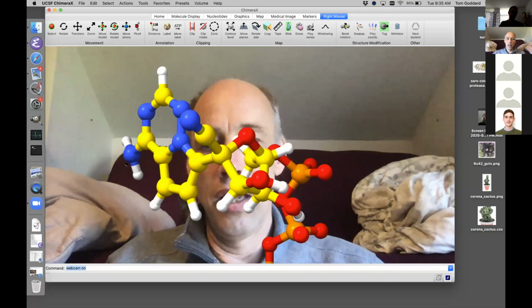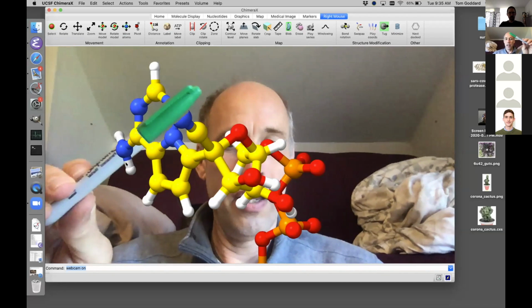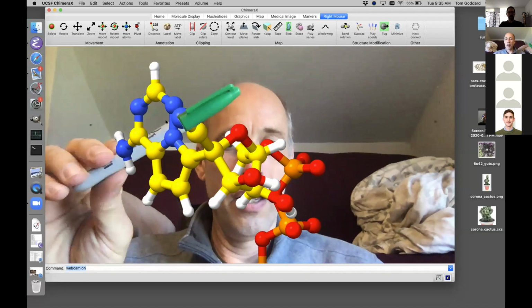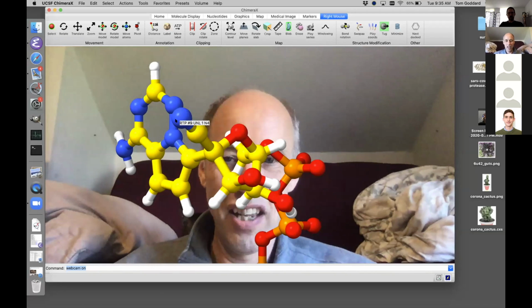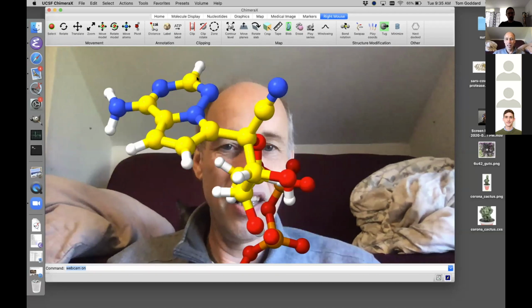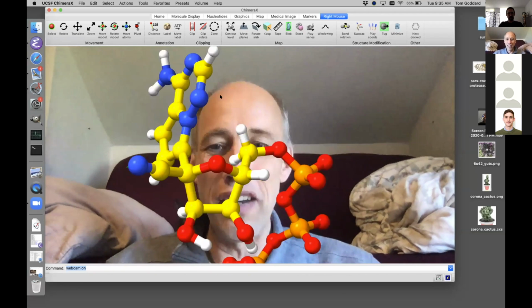Tom, is that green arrow that's been showing up, is that you tugging it? Yes, I was just using the mouse. I just clicked on an atom and tugged it around. Okay, great, thank you. Oh yeah, it's just a little green arrow. You don't see it very often.